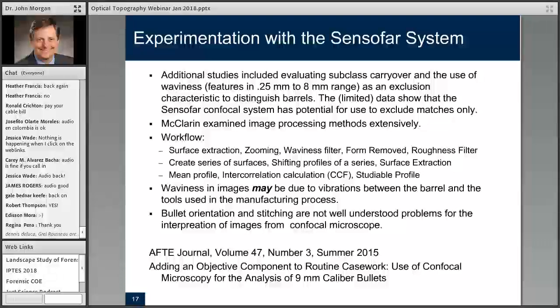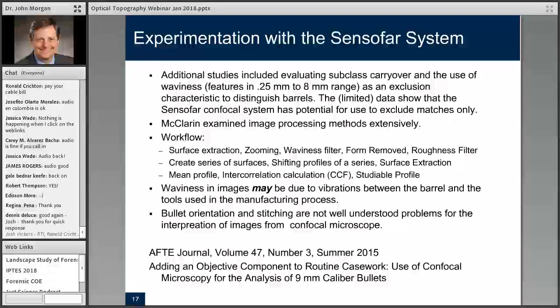And so in the long run, when you're looking at optical topography data, the use of the raw data in order to do quantitative analysis is the way to go. And you want to be very careful about choosing the amount of analysis that you do.